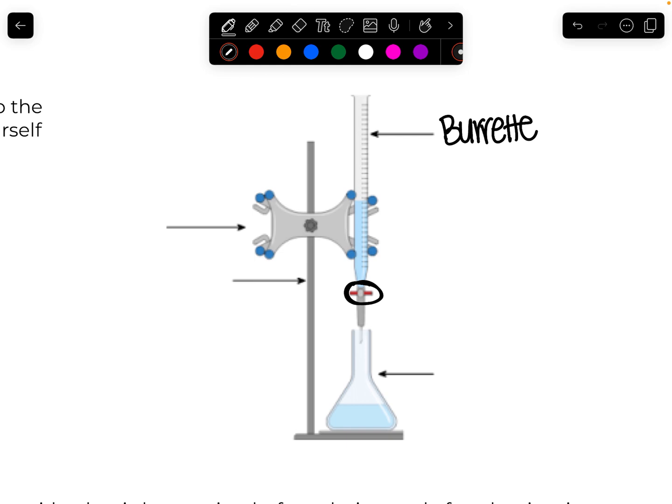I'm going to tell you what this is called now, which is great because you can pause the video and control your laughter there. And then tomorrow when you come in, you're going to be so responsible and mature that you're never going to laugh at this word again. So this is called a stopcock. I'm 14.